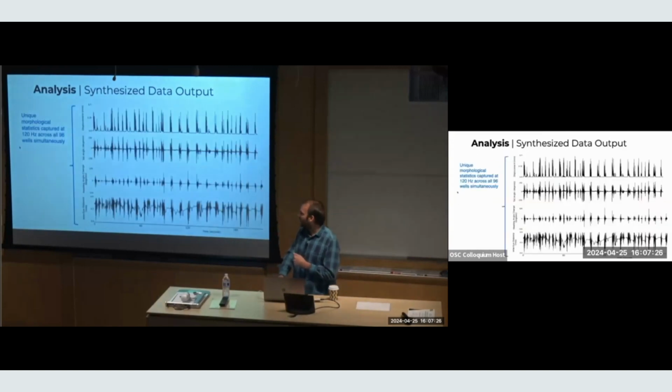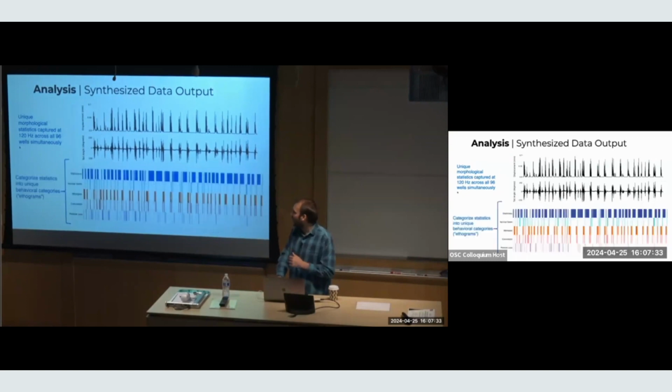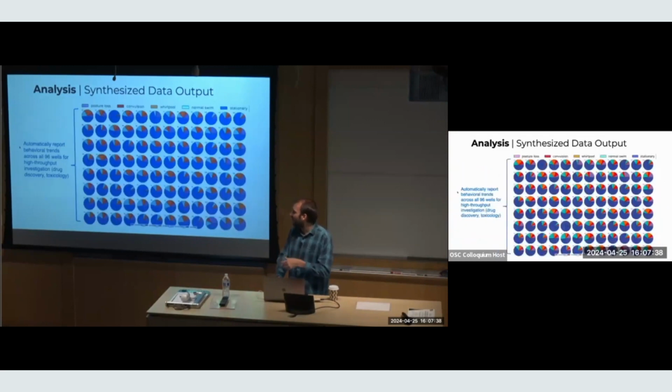Okay, and so for these zebrafish results, we've developed analytics. I won't really dwell on this, to look at how they're moving over time. We then distill all of this into these categories of behavior. And at the end of the day, we simply present biologists typically with these type of results, which they really love. They don't love seeing gigapixel videos or 96 videos, right? It's too much.